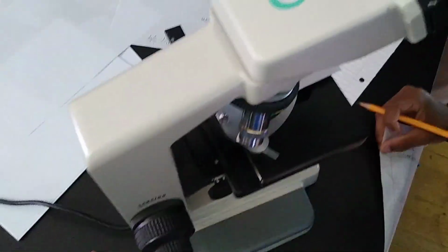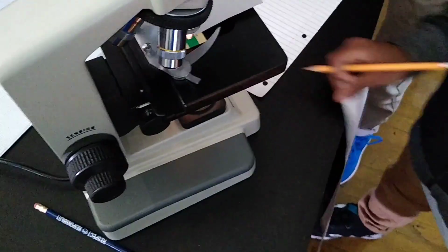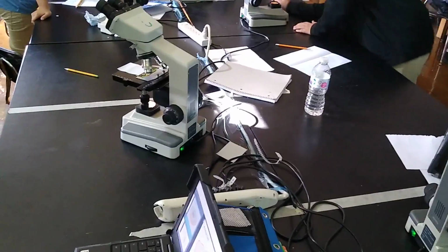So what are the microscope kids doing? Tell me all about it. Stem of corn. That's stem of corn. What's this one over here? Fruit fly. This is the leaves. Okay, so you have to do these from memory? Yeah. And what are the diagram students doing?